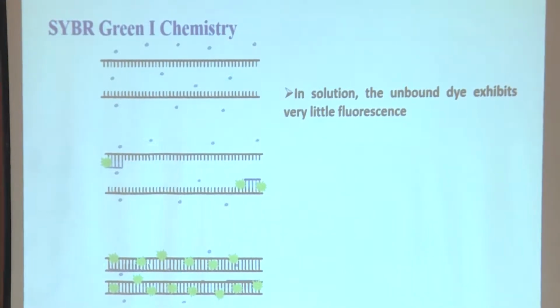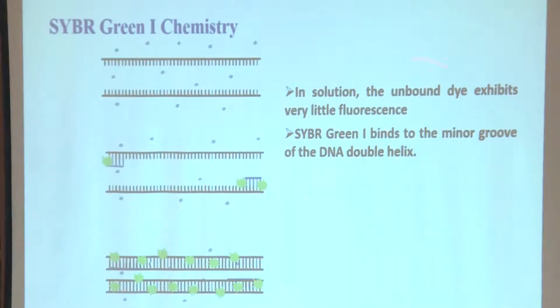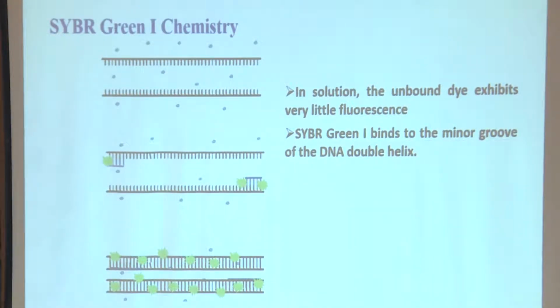The dye that was added in the mixture is unbound dye which exhibits very little fluorescence, or if there is a little binding, that is usually not detectable. Now, SYBR Green binds to the minor groove of double stranded DNA helix.